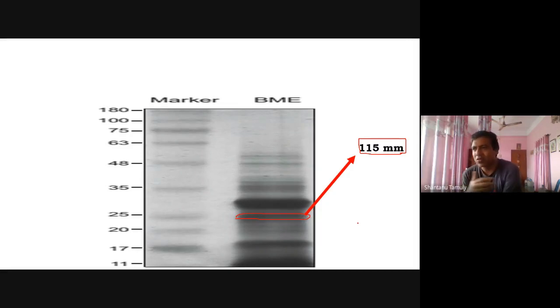You can search on the net, and through that literature search you will come to know what exactly this protein is. Once you know the molecular weight, you will know what protein it is. Similarly, if you want to know each and every protein present over here, you have already obtained the value of the M and C.